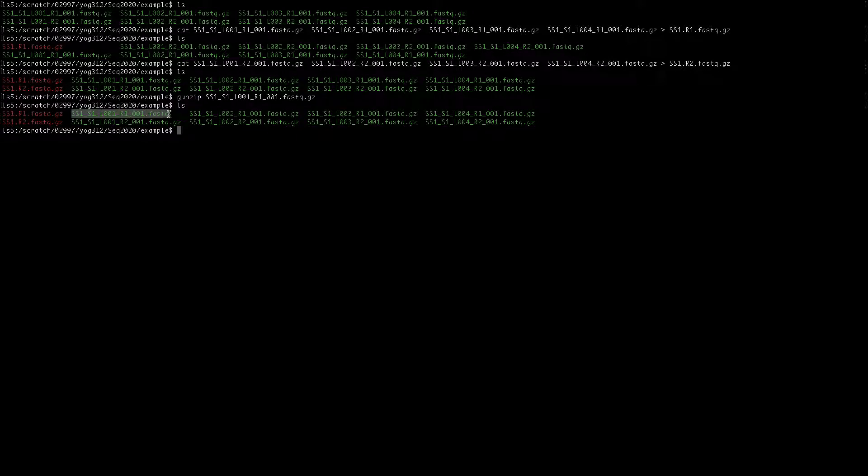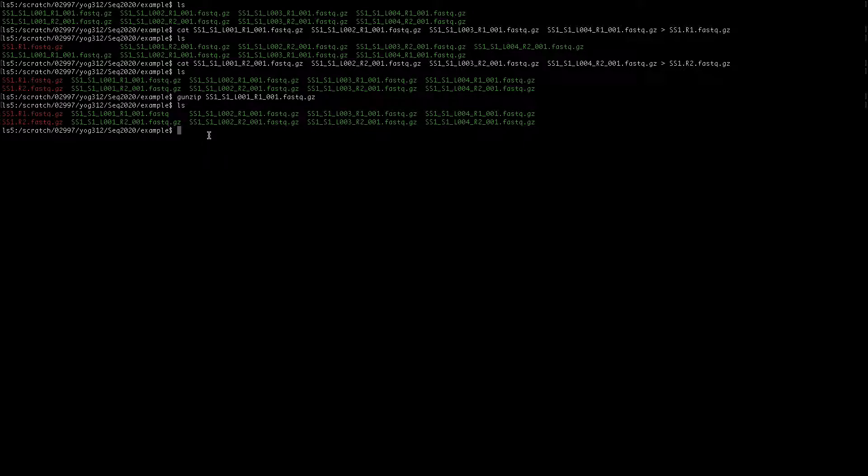That's it. That's how you can concatenate a number of FASTQ files into one and unzip FASTQ.gz files using gunzip.